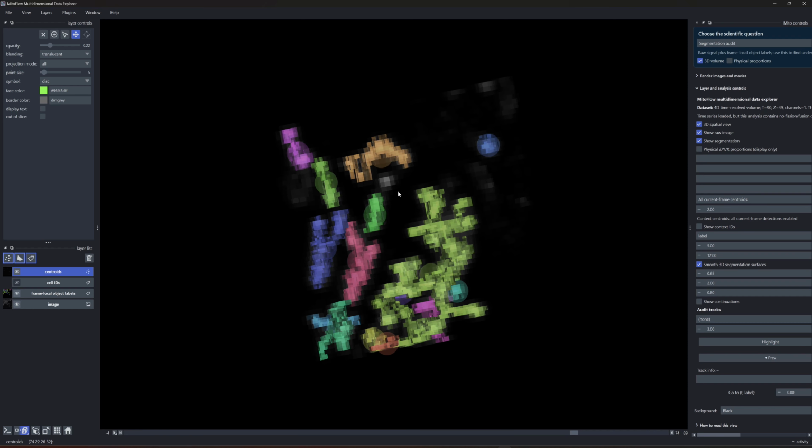You start to learn how to format different files so that you can get your analysis done as efficiently as possible. And there's an even bigger and maybe more subtle problem, and that problem has to do with how expensive this can be. Four-dimensional analysis, specifically in terms of mitochondria dynamics, can be extremely expensive. And I'm not just talking about the cost, I'm talking about the time that you invest into it. I've watched some really good labs postpone their analyses because of the software complexities and the workflow pipeline chaining that comes along with it.